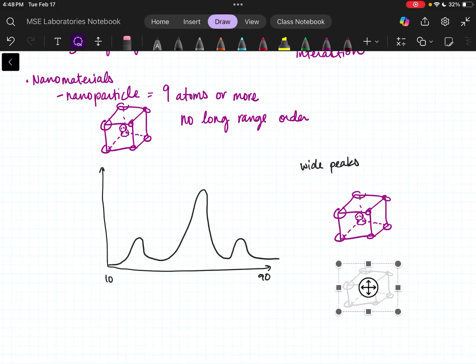Paste. Now let's say that this one got just like stretched ever so slightly, where this one got smooshed that way. I now have the same unit cell and all three of them have a slightly different A, B, and C value, meaning any repeatability to them is very minimal. Okay.